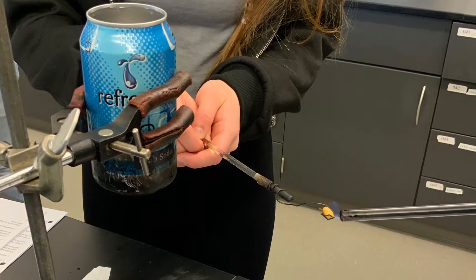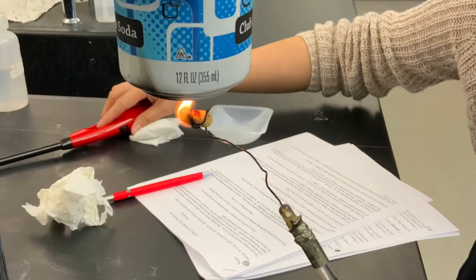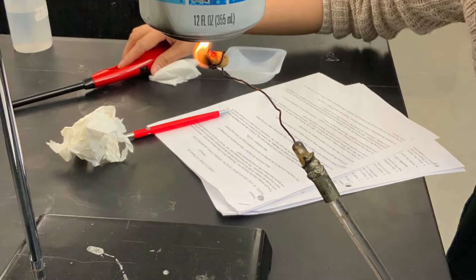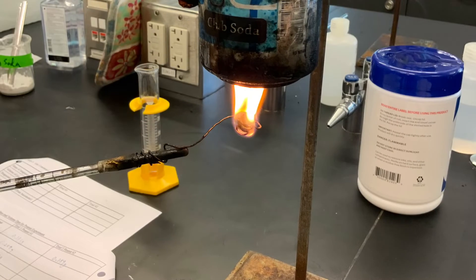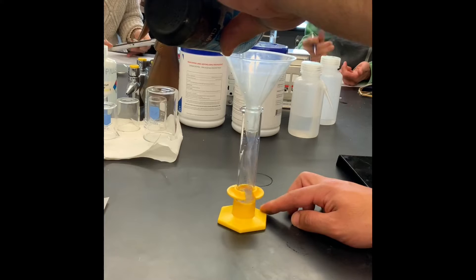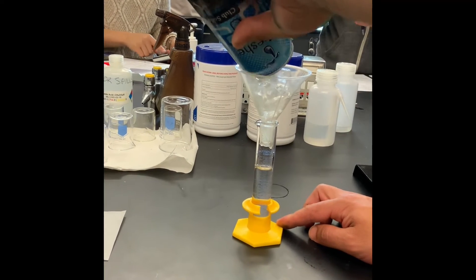After getting the mass of the peanut, we're going to burn the peanut underneath a calorimeter filled a third with ice. We're going to burn that, re-weigh the peanut, and then collect the water into a graduated cylinder to measure the volume of water produced by burning the peanut.